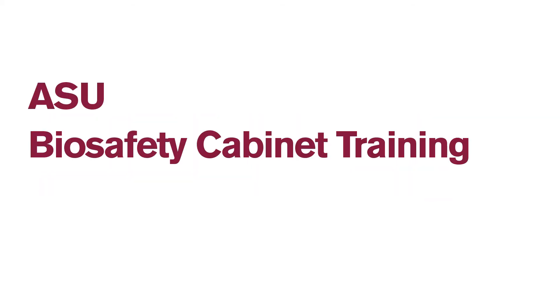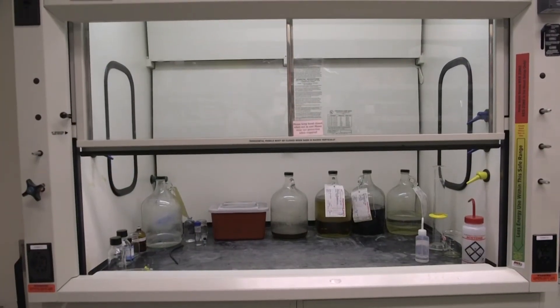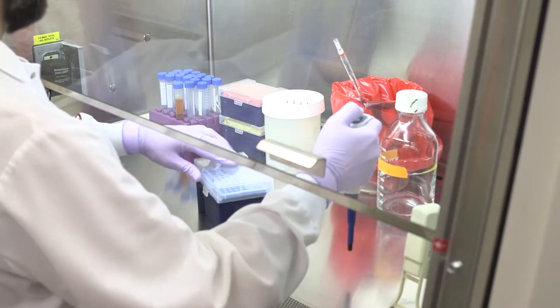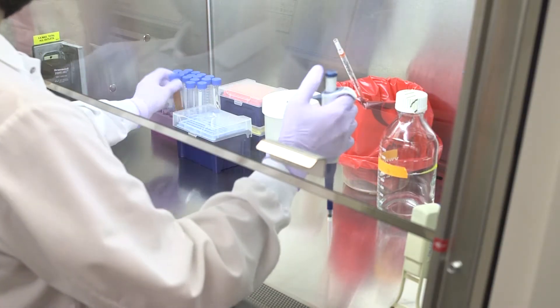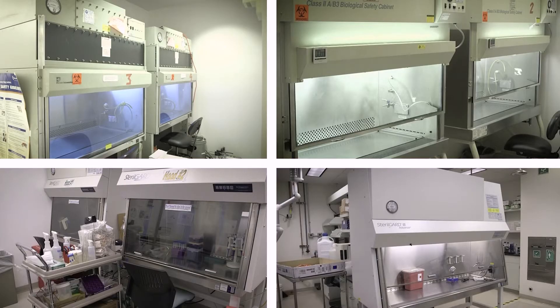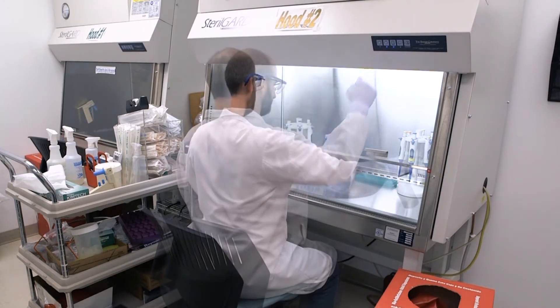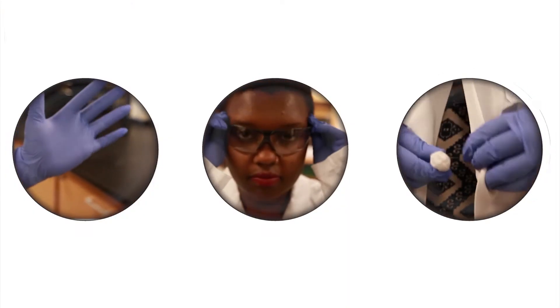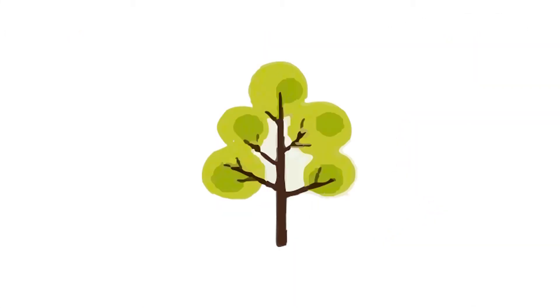If you work in a laboratory environment, you probably have seen different types of safety hoods and cabinets that are used for different experiments or laboratory settings. All of these hoods and cabinets are designed for a specific type of work. It is important to be able to recognize each of them and understand the work performed in them. This video is designed to show how to properly use a biosafety cabinet to ensure the protection of laboratory personnel, the samples they are working with, and the environment.